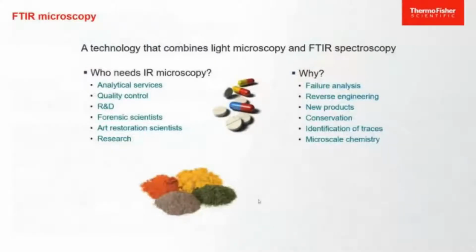The first question that we wanted to answer was why? Why FTIR microscopy? And who uses it? The answer to who uses it is fairly easy, and that's anybody in an analytical lab or a quality control lab or an R&D lab.